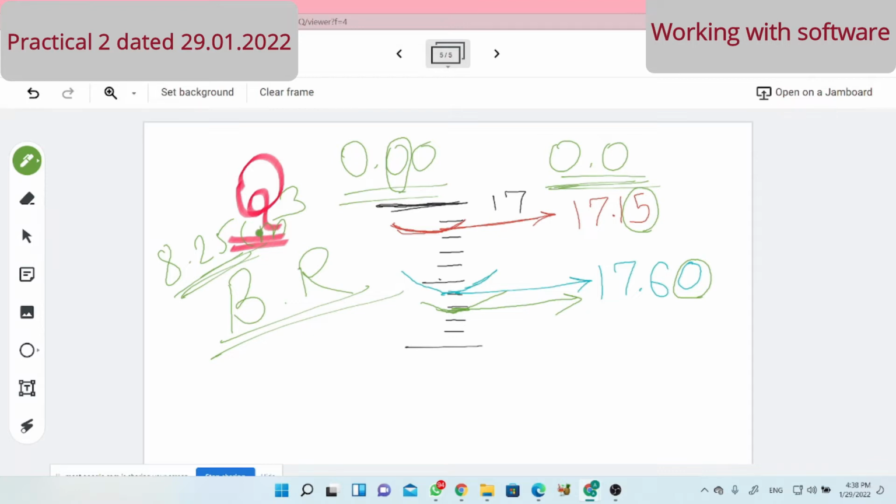No problem, sir. Actually, I made a mistake, because eye level is important. If that eye level is not kept properly, then variation in readings is possible. If you keep it properly, then you will get the perfect number. Okay. The main point is there is a burette reading: initial reading, final reading, and then the difference. And the difference is the burette reading that we consider.